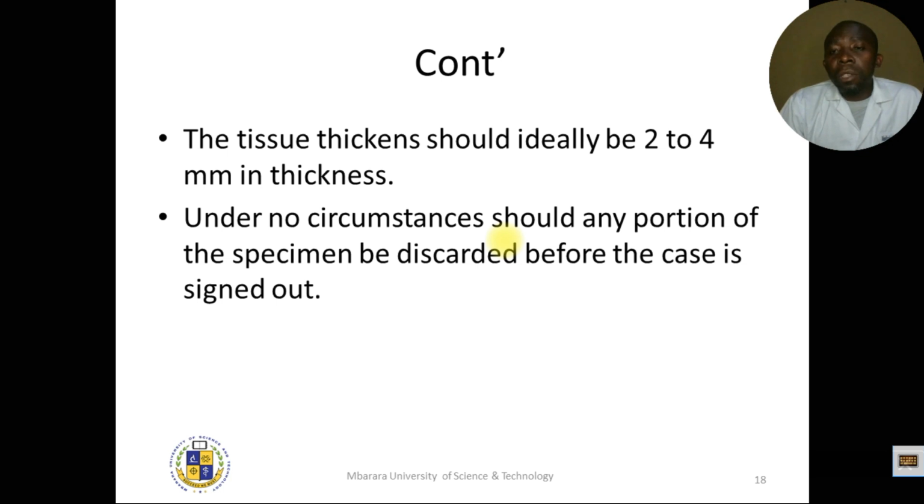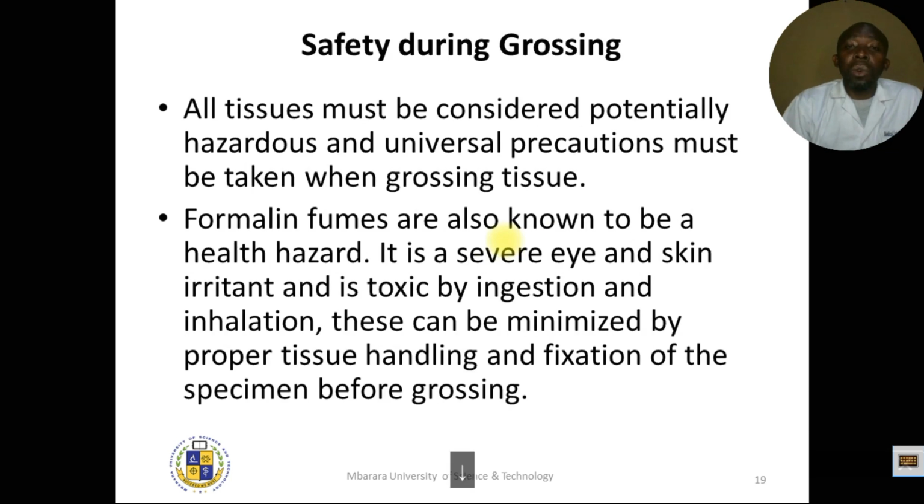So under no circumstance should any portion of the specimen be discarded before the case is signed out, because what you discard may actually be the portion of interest which may be required to make a diagnosis. So don't throw away any piece of the tissue until you conclude the case.